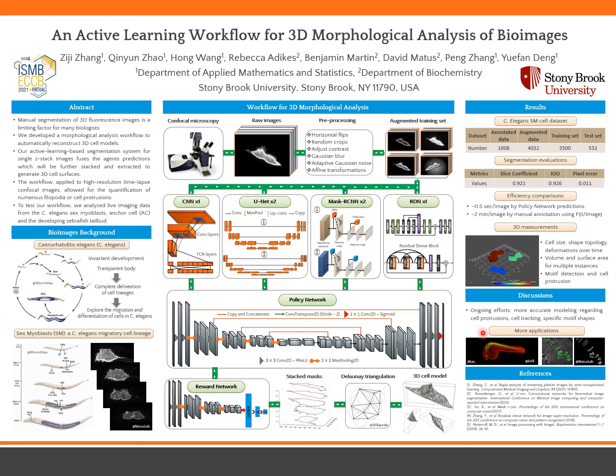Our workflow significantly reduces time-consuming human workload and produces robust results validated by statistical analysis. We anticipate that our workflow and the ease of acquiring 3D morphological results will attract further image studies in the fields of computational biology, cell and developmental biology, and biomechanics.